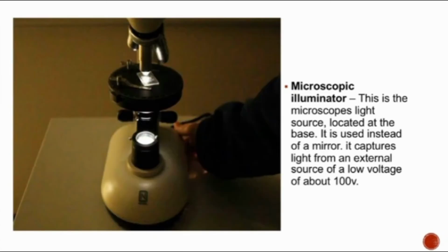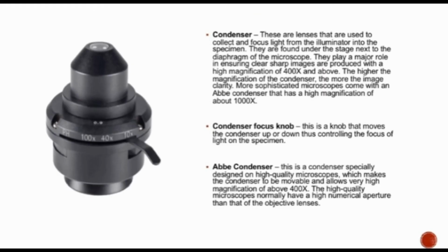Microscopic illuminator. This is the microscope's light source. Located at the base, it is used instead of a mirror. It captures light from an external source of a low voltage of about 100 volts.